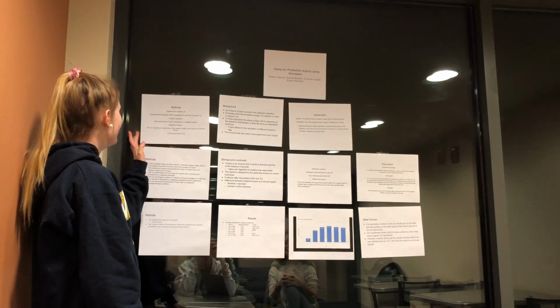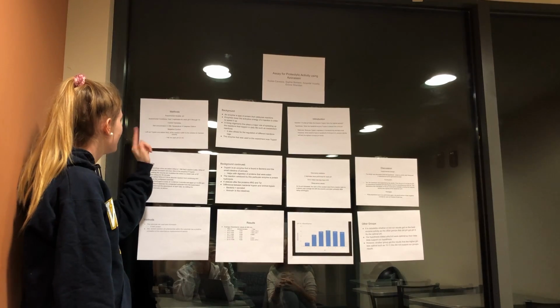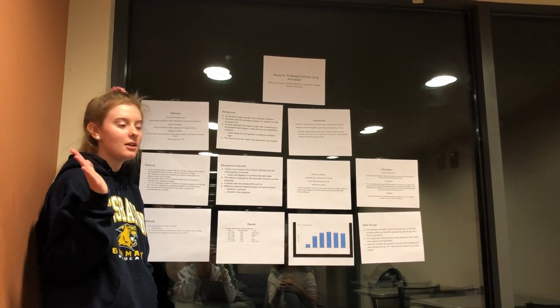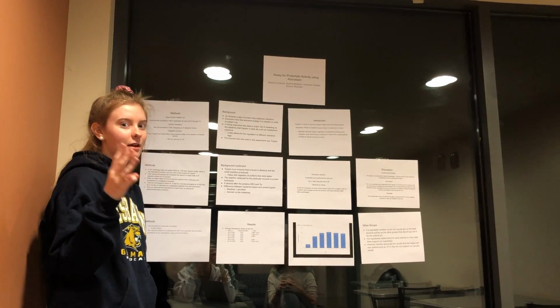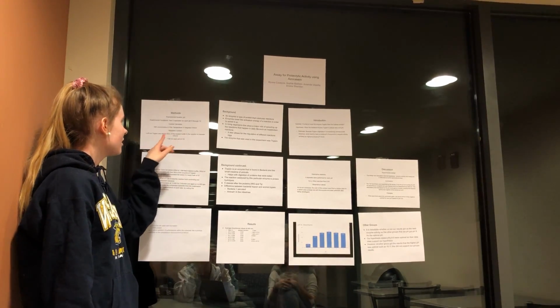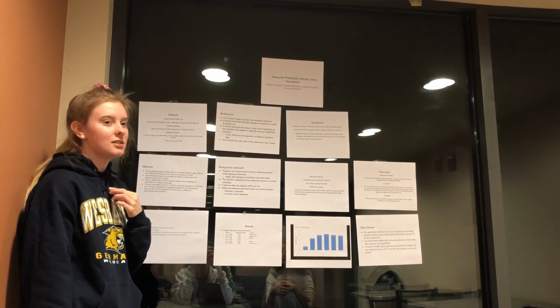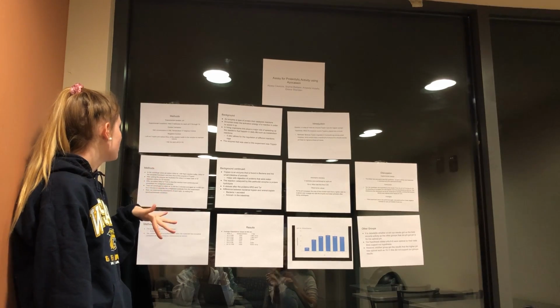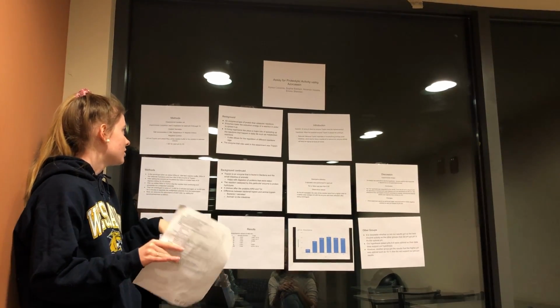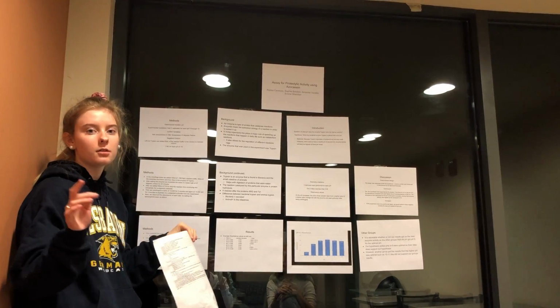So what we did was we took our experimental variable of pH, and our conditions were that we had 3 replicates for each pH 5 through 10. So we had 3 5s, 3 6s, and so on. Our control variables were a salt concentration of 0.15 moles and a temperature of 37 degrees Celsius. Our negative control was that we left out trypsin and added 50 microliters of the reaction buffer to the solution to maintain its volume, with 1 negative control per pH.